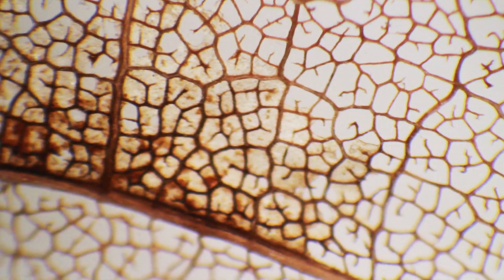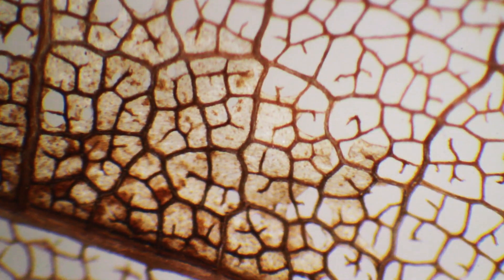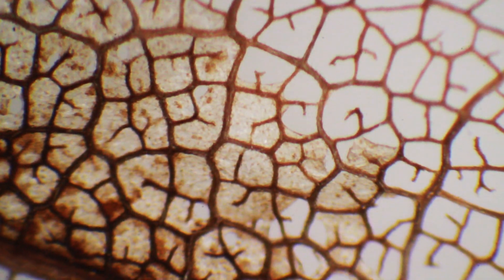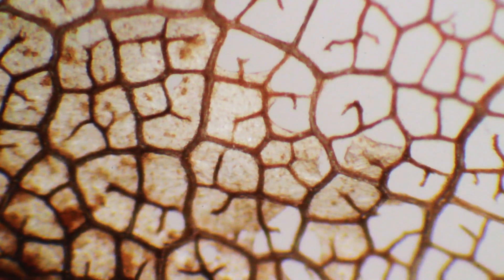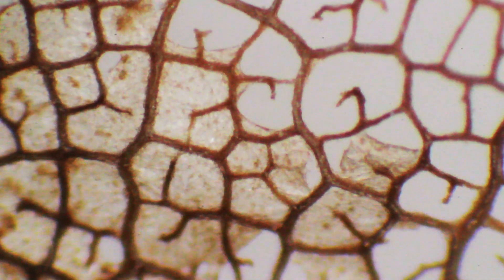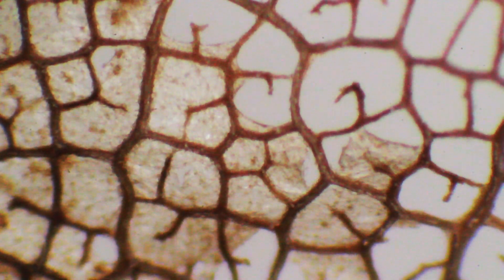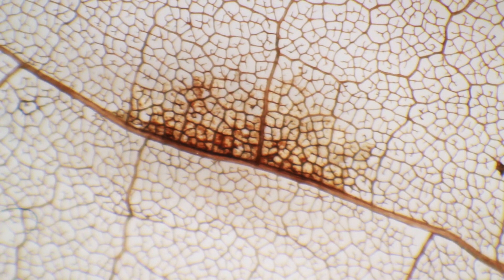I'm doing this manually now. In contrast to the previous image that I showed you, this is now an optical thing that I'm doing. I'm able to zoom in all the way from seven times magnification to 45 times magnification. You can still see that between the vessels there is still a little bit of tissue sticking — should have removed it a little bit more carefully. That is, of course, the leaf that I did not stain. You can see how intricate the details are and it looks kind of nice. The light was already quite dark, so you can see a little bit of camera noise. I zoomed out too quickly, so the camera was not able to adjust to the brightness as quickly.